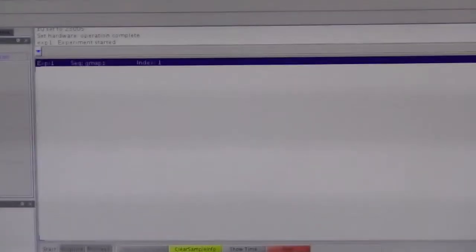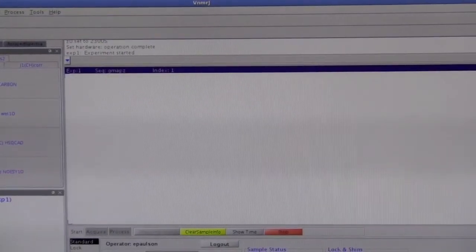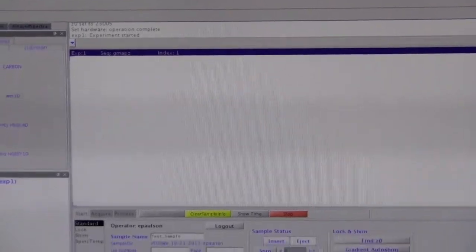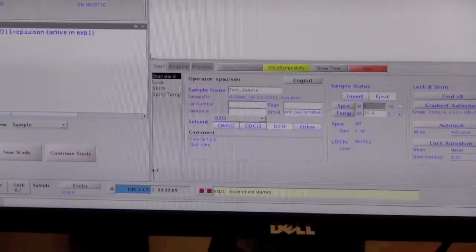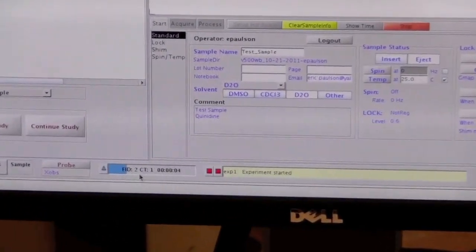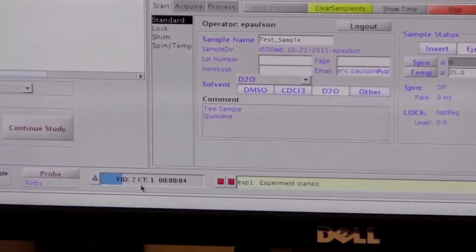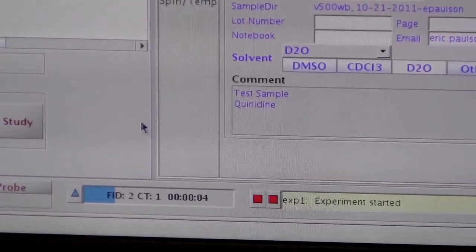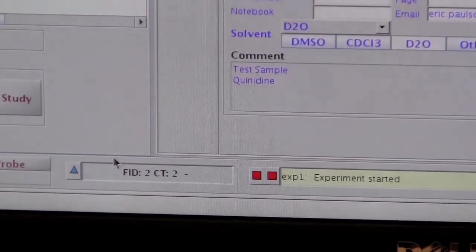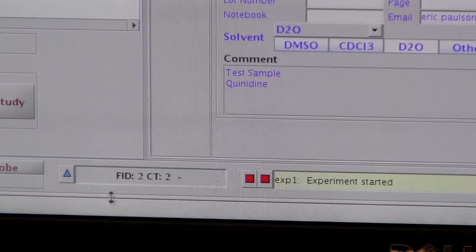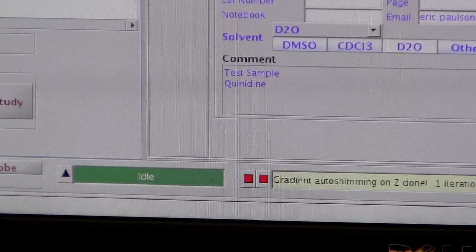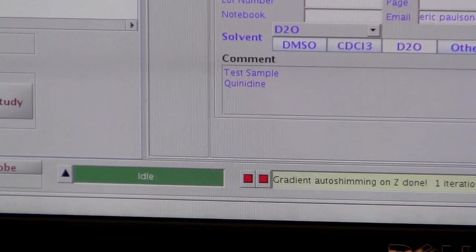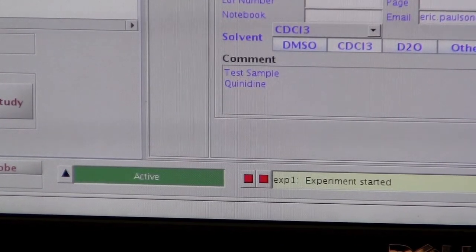It will do multiple iterations of gradient shimming to try to get the shims to converge. If it cannot get them to converge after several iterations, it will eventually give up. But depending on how well your sample is able to be shimmed, in this case it was fine.